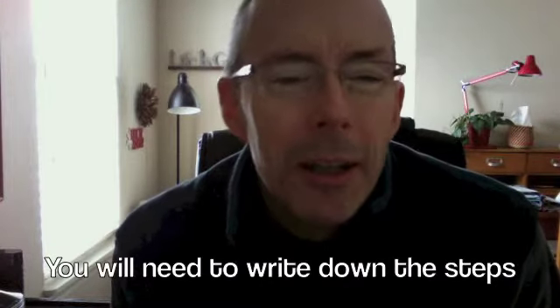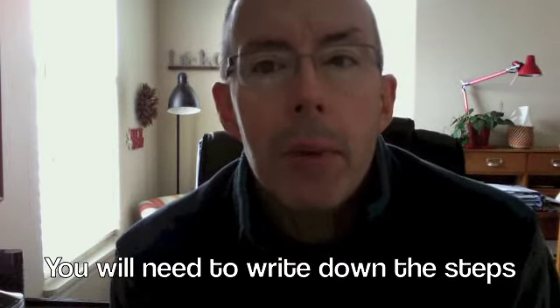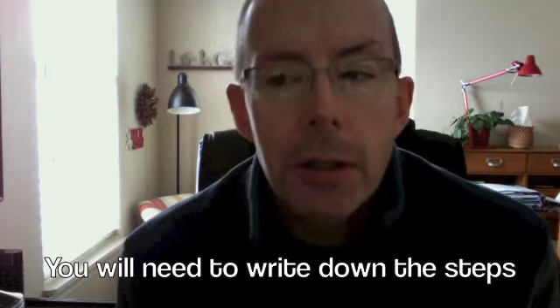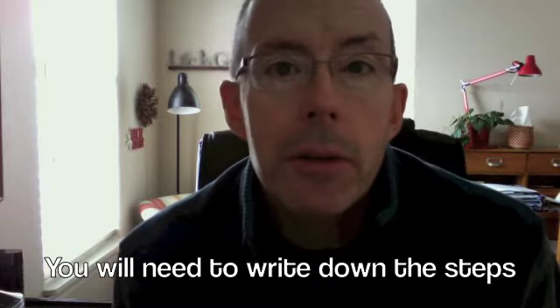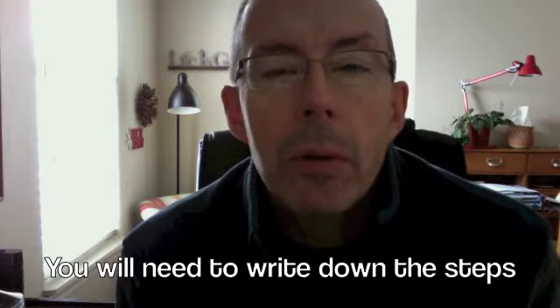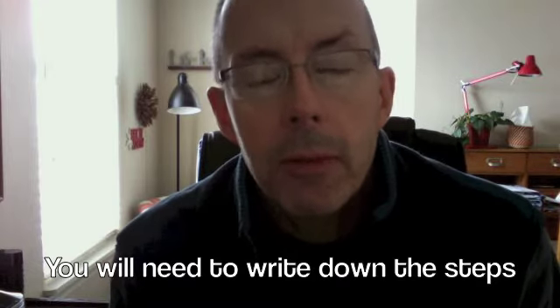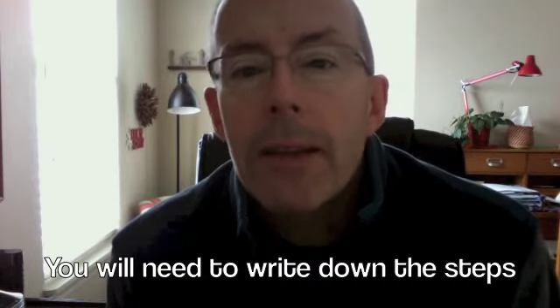After you've taken the quiz, probably before you take the quiz, you want to write down the steps of the process, all the way from turning on the machine to the calibration to cleaning up, all those pieces, because you're going to want those when you actually do the test. So I will let you know before we do the actual turbidity test on whatever day we're going to do it on, hopefully Monday, whether or not you have passed the Google test.